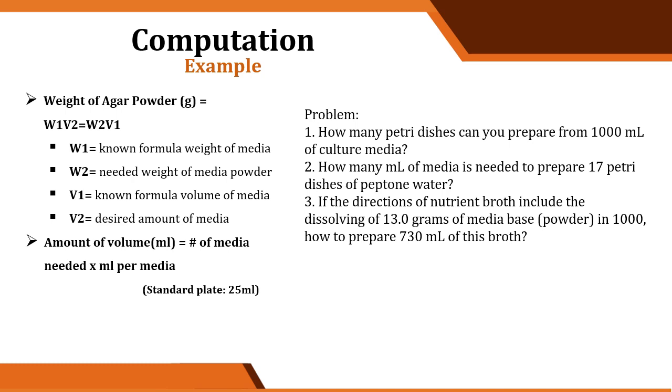Okay? So, then dissolve by heating until boiling. So, autoclave for 20 minutes, then let it cool and pour in petri dishes. So, if we need to prepare 1,000 ml or 1 liter of nutrient agar medium, so we should dissolve 28 grams of media powder.